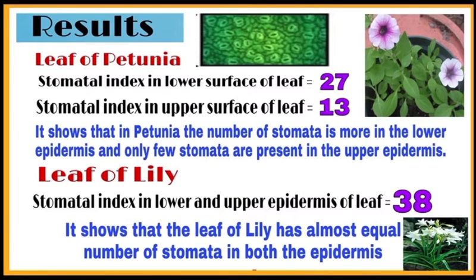in the upper epidermis. For leaf of lily, stomatal index in lower and upper epidermis of leaf is same, that is 38. It shows that the leaf of lily has almost equal number of stomata in both the epidermis.